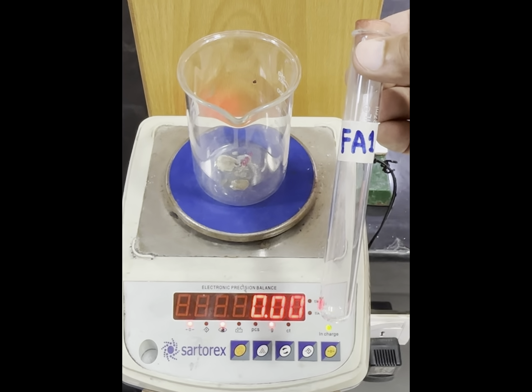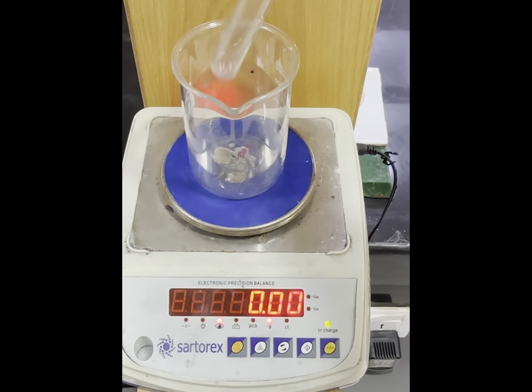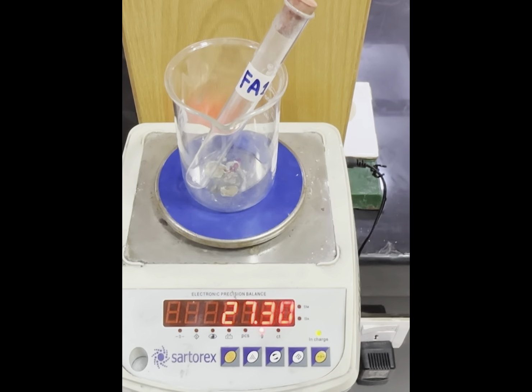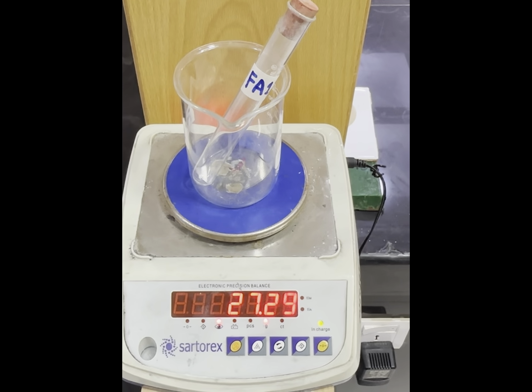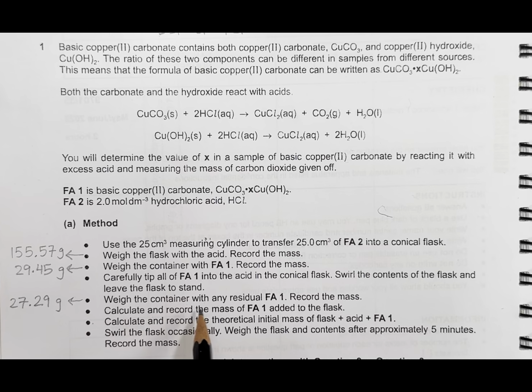Now let's take the mass of the container with any residual Fa1. So the mass is 27.29. The weight of container with any residual Fa1 is 27.29. The next part says calculate and record the mass of Fa1 added to the flask.